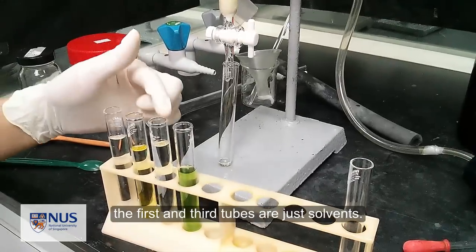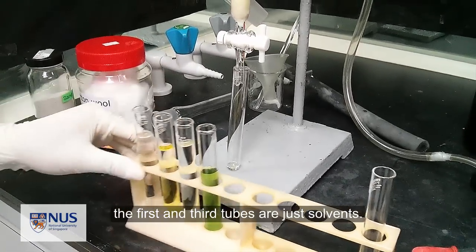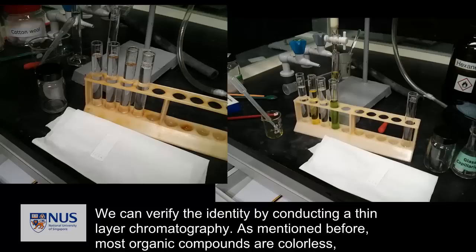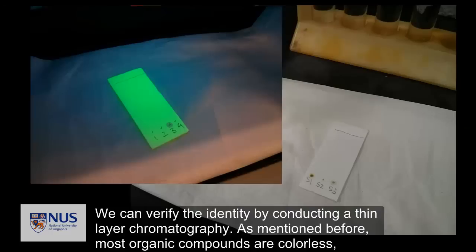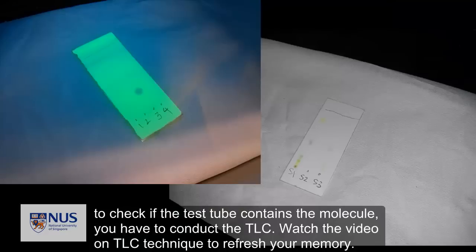The first and the third test tubes are just solvents. We can verify the identity by conducting a thin layer chromatography. As mentioned before, most organic compounds are colorless, so to check if the test tube contains the molecule, you have to conduct the TLC. Watch the video on TLC technique to refresh your memory.